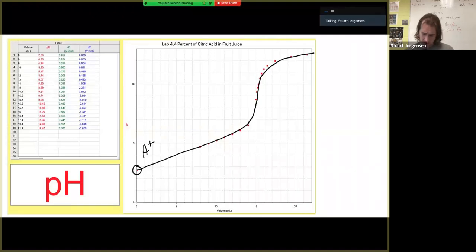Personally, I don't think I could put in a straight line. I'm going to go ahead and just add the best straight line I can do here. The middle of that appears to be approximately right in here. Now notice, as we're looking here, we now know 2 very important data pieces. Let me erase my tangent line just to make it easier to view that slope. Here's the midpoint of that inflection. Here's where I've got the steepest slope.